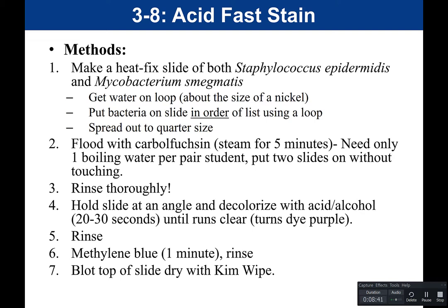We use a loop, not a needle. When we add our bacteria to the water, we spread it out to about the size of a quarter. We air dry it and then perform our heat fix step — making our heat fix smear of Staphylococcus epidermidis and Mycobacterium smegmatis. Once we have our heat fix smear, we're ready to do our staining procedure. We take a beaker of water, boil it, put the slide across the top, and flood it with carbolfuchsin — our primary stain — and steam it for five minutes.